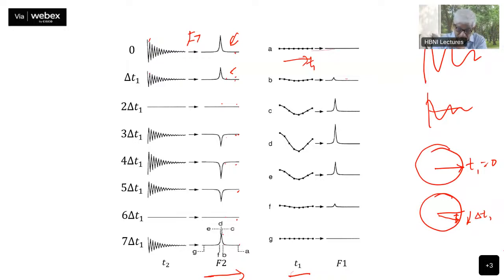You take the point C, which is close to this. This is a very high signal at this point. Therefore, it shows a much larger dip here. The intensity of this point is large, therefore it shows that variation. It also shows variation because the value is not the same in all the spectra. Now if you do a Fourier transformation along this again, what is this? This is the second Fourier transformation, along the T1 dimension. So your time variable is now T1. If you do this, you get this.